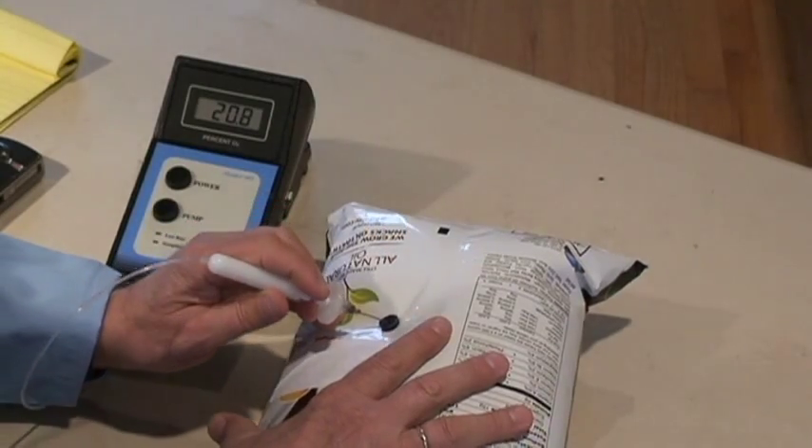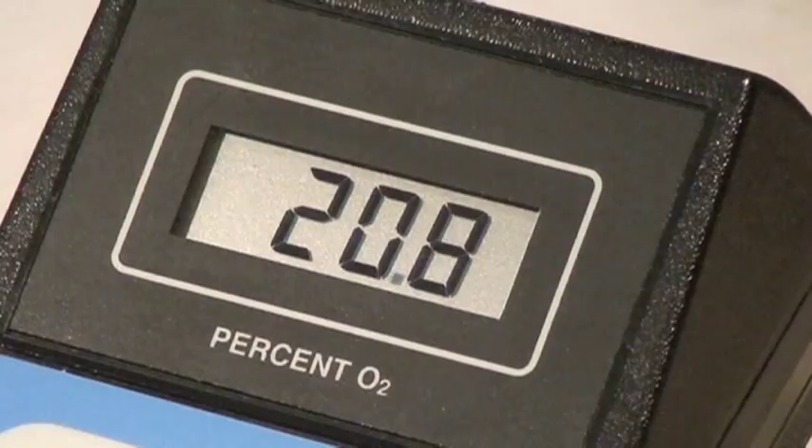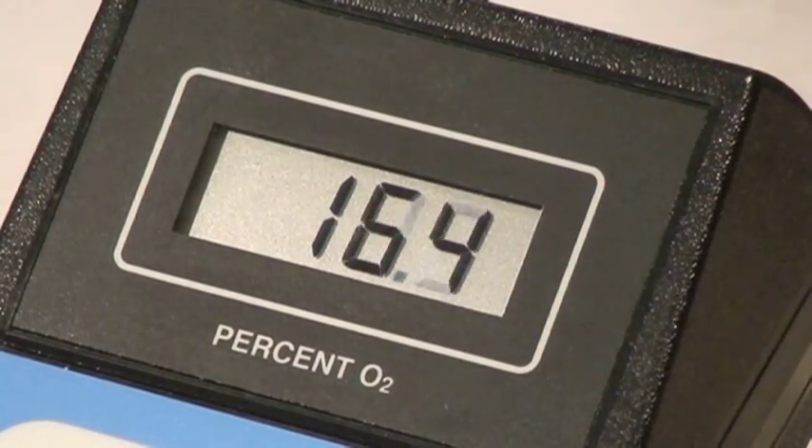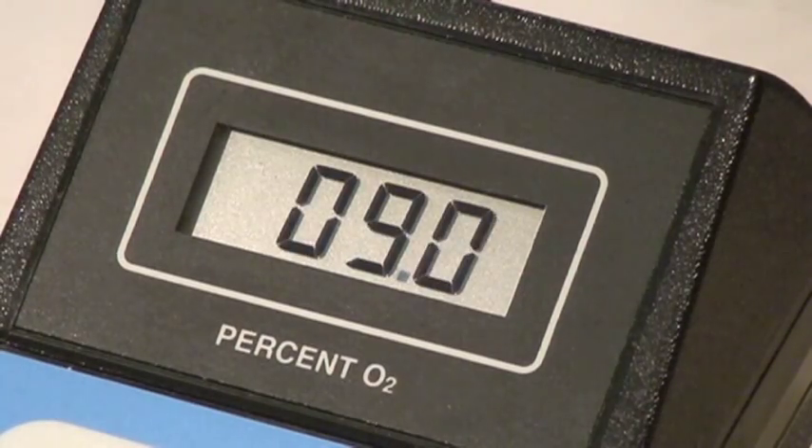We'll puncture into the bag and depress the pump switch. The pump will come on for 7 or 8 seconds and draw the sample in, then the pump turns off automatically.